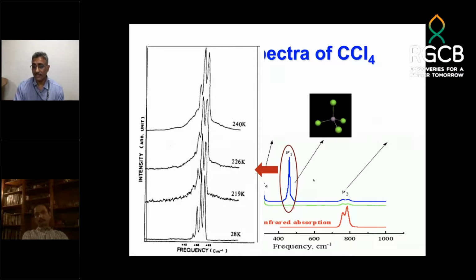Now, whenever you have a peak which doesn't look like a single value, whether it is NMR or mass spec, or any spectroscopic tool, whenever you think that you have a peak which is more than one, you have to lower the temperature, because whenever you lower the temperature, the peak width actually reduces substantially, and you will find that there are many peaks.